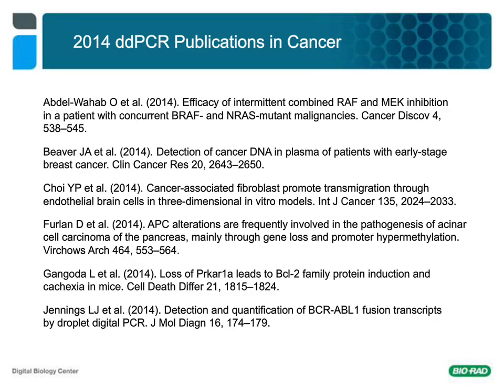We were testing whether we could detect methylated cell-free DNA. The problem with the sample type is that cell-free DNA has very, very low amounts of DNA, and when you do your bisulfite conversion, you get an even lower percentage of DNA recovered due to the conversion process being fairly harsh. But it is possible and absolutely measurable.